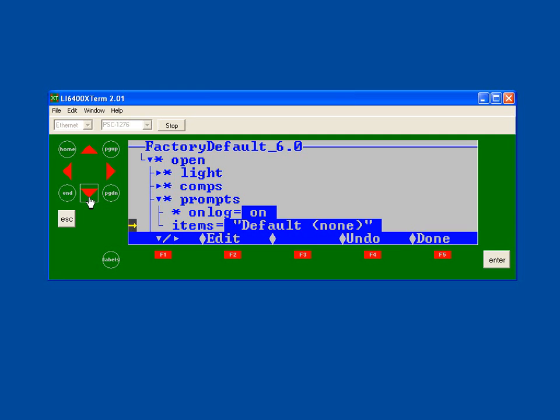But since you do a light curve on just one leaf, there's no reason to enter all that information every time a data point is logged. But for survey measurements, each time we log, we are on a new leaf, so we need to enter all that information. So that's why it's good to keep that on log set to on for a survey measurement.